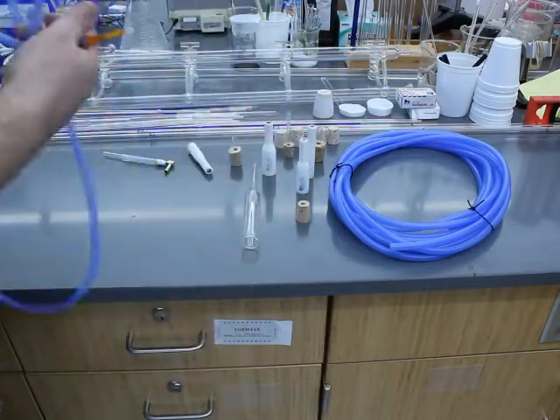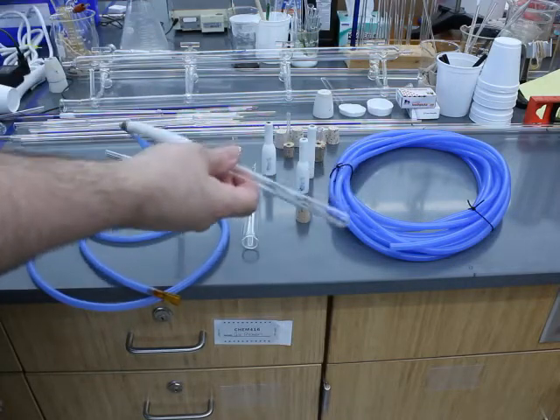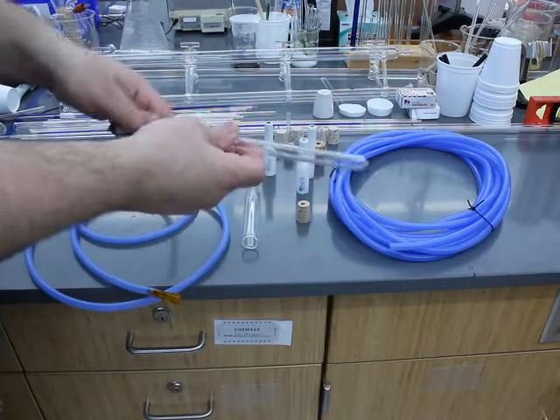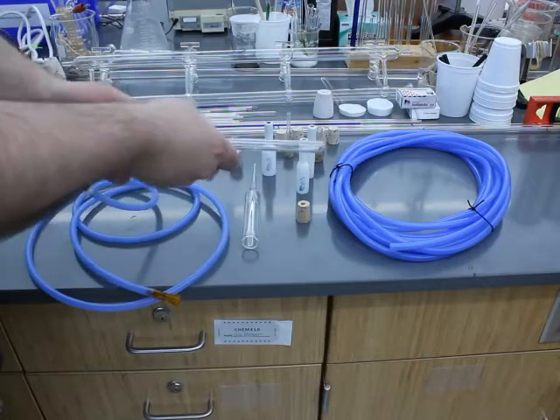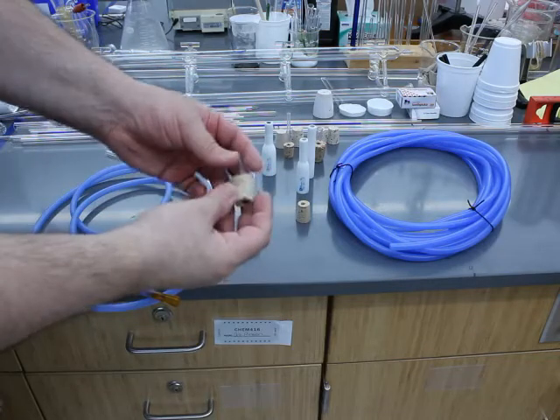This is closed, so obviously you can't do it if it was open. The way I learned using a blow hose, instead of these really nice silicone adapters, we use corks.